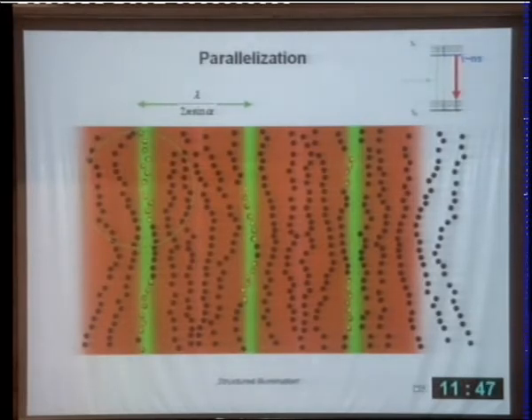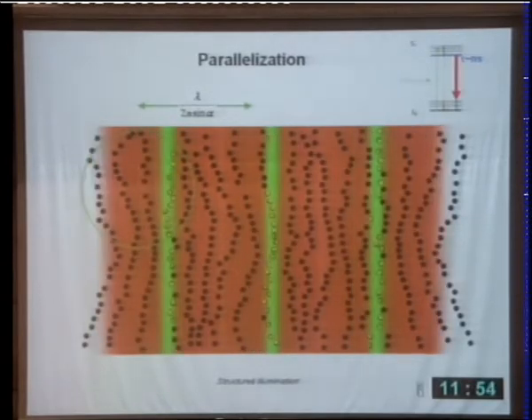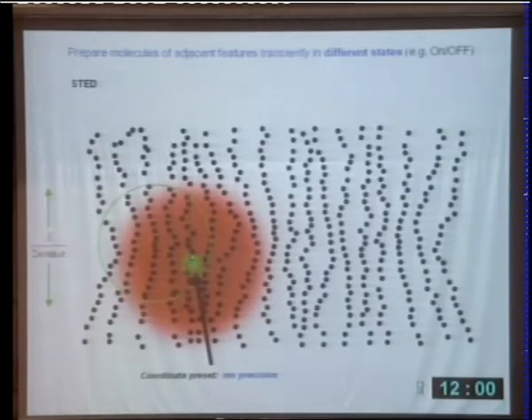Of course, parallelized, say, sub-diffraction resolution imaging was first done as structured illumination, pioneered by Mats Gustafsson and Rainer Heinzmann, and this is, of course, very well known as a concept. You can also use lines. They have to be further away than the diffraction barrier. If you use lines, you have to turn the lines to get also the resolution in the other direction.